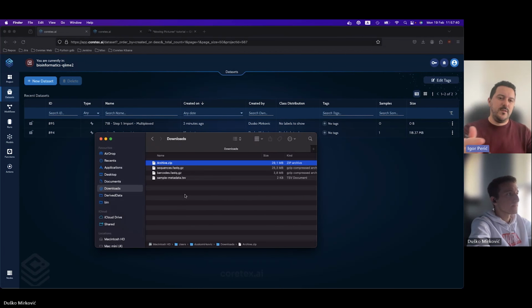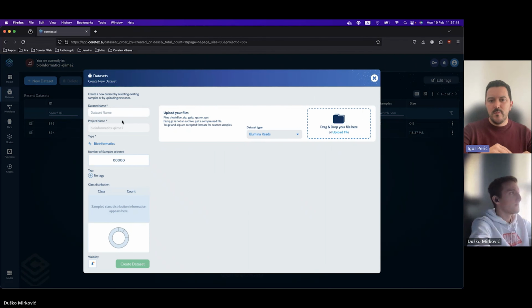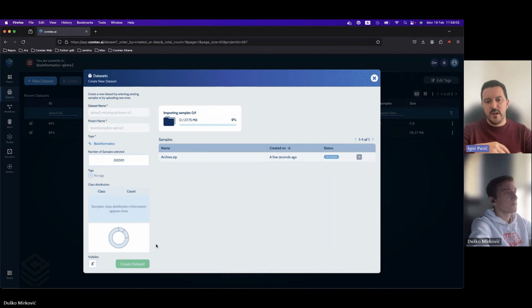Yep. Right now. And you saw that by looking in the code. This is a very specific example of something being hard coded, but you see how we were able to see exactly what went wrong because we were capturing all of the output and showing it in the console. A good practice is leaving these namings and all of these things as parameters, so the user has an option to change them during the runtime.